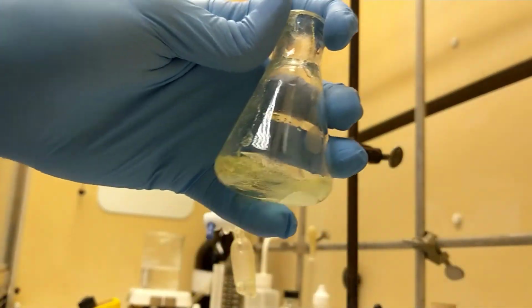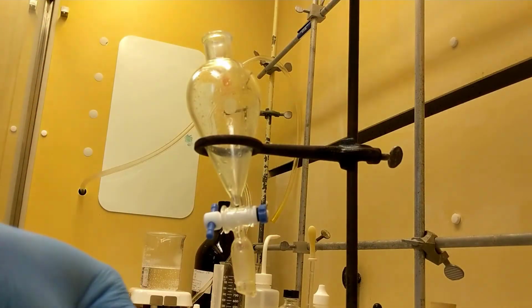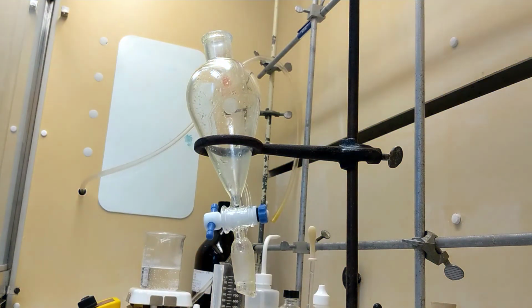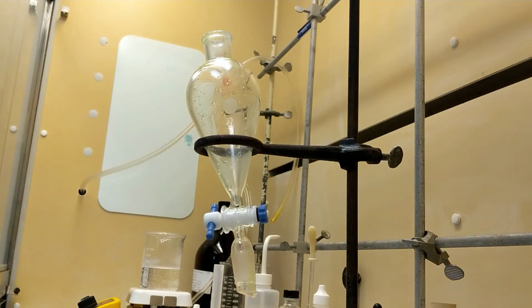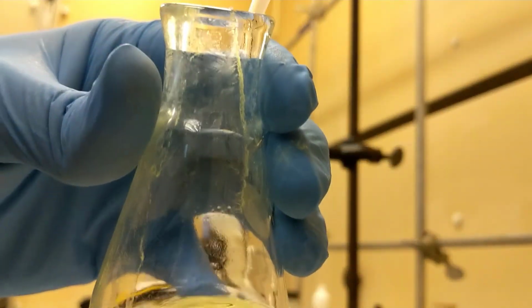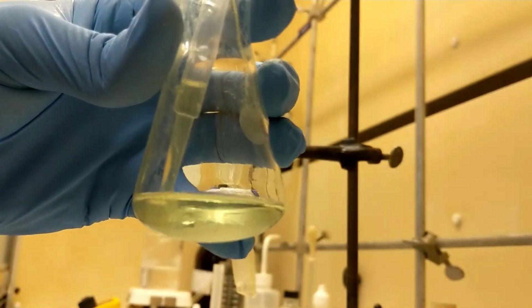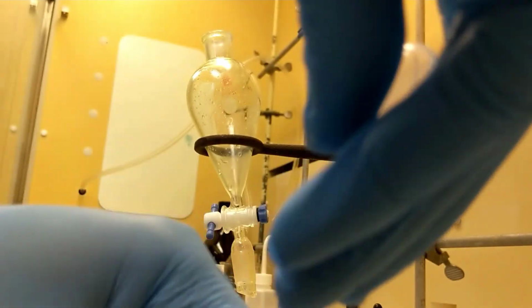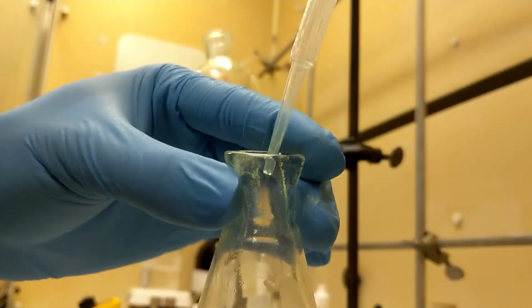Now, I'm going to extract this with the Pasteur pipette and put it into my pre-weighed flask, which is right here. And then I'm going to evaporate off all of my ether. Here's my Pasteur pipette. I'm just going to suction off this solution. Sorry, I know I'm all up in your face. It's hard for me too.